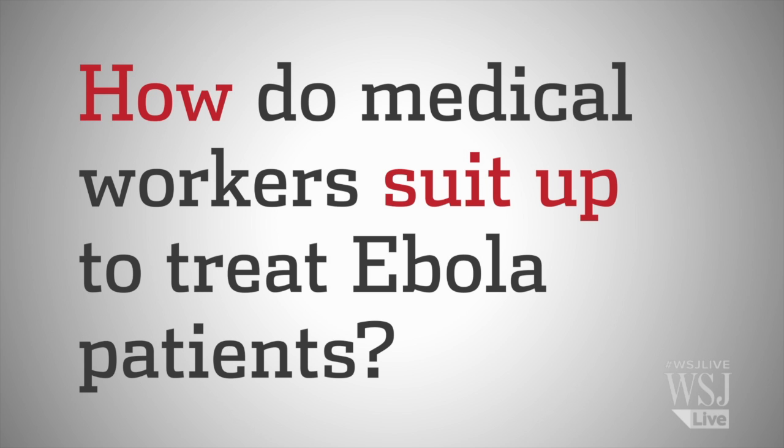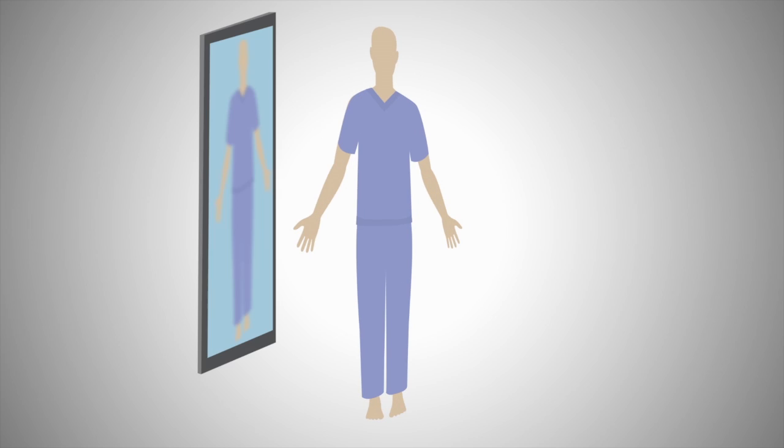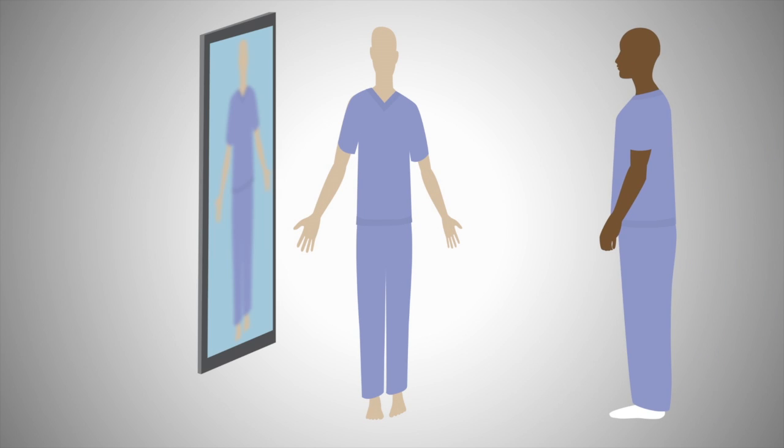How do medical workers suit up to treat Ebola patients? The medical worker suits up in front of a mirror, typically starting out in scrubs, and has a second person observing to do buddy checks.